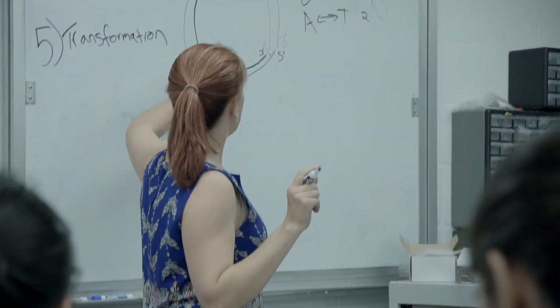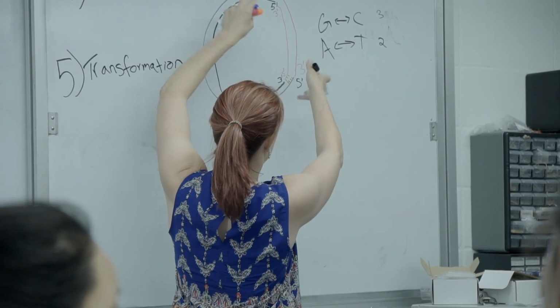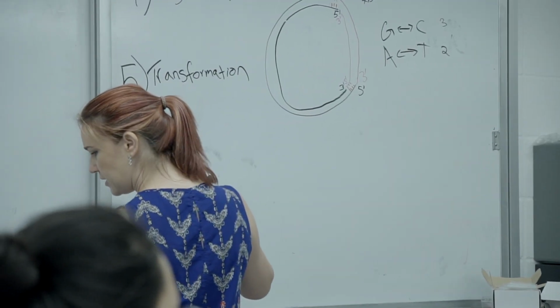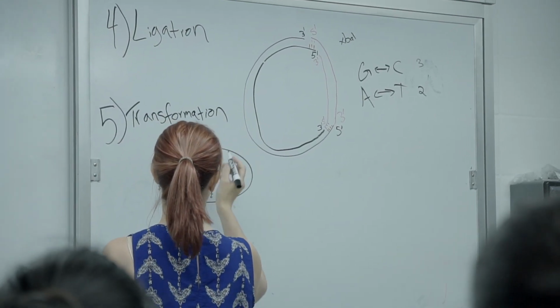We had the question, how do we know that this works? Because maybe our ends just stuck together. So we're going to actually select colonies first. So what we're going to do is, here's our bacteria.